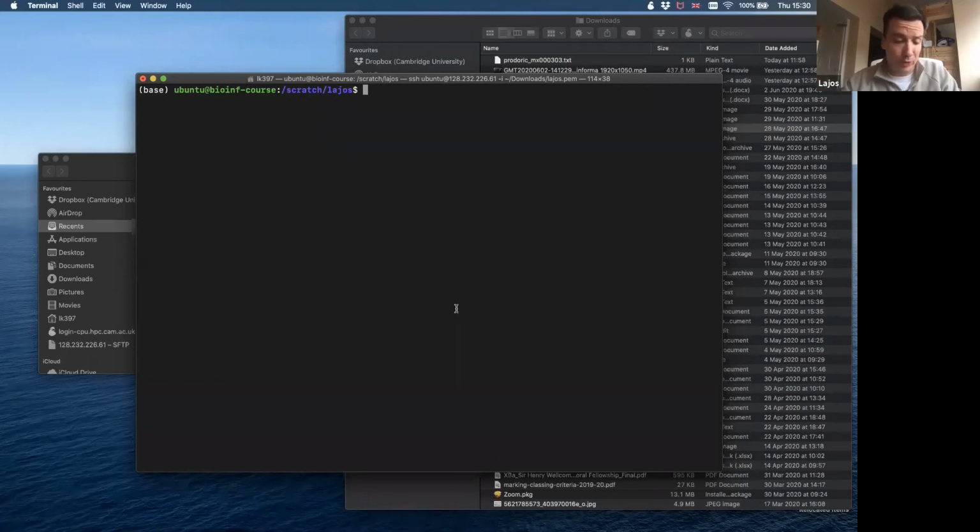I don't know which program it was, maybe the Prokka or the Snippy, or I don't know which one. But if you just say BLAST and then push tab twice, then you can already see that we have BLAST N and BLAST P and BLAST X. And I think the 4th one is the T BLAST N, or T BLAST X. There's a 4th one. So okay, let's just go through them and we will see.